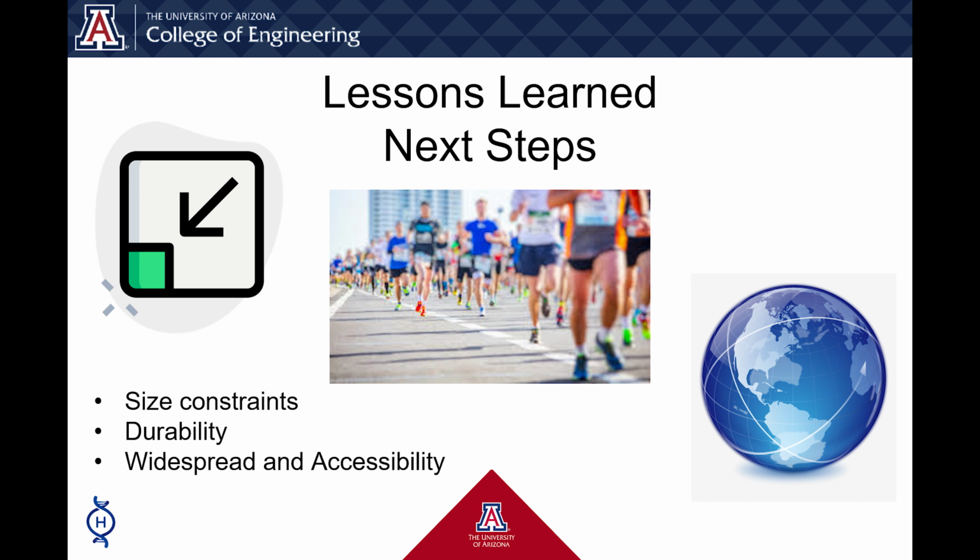First, further miniaturization of the module to integrate into their environments. Second, the exploration of advanced materials that extend durability and enhance performance. It would also be useful to develop it to be set for high volume production to be integrated into a widespread of labs.